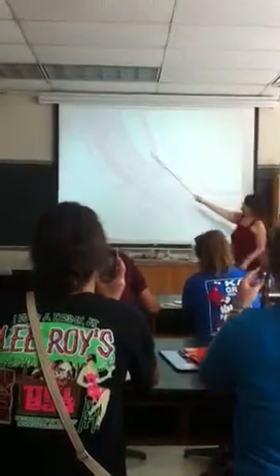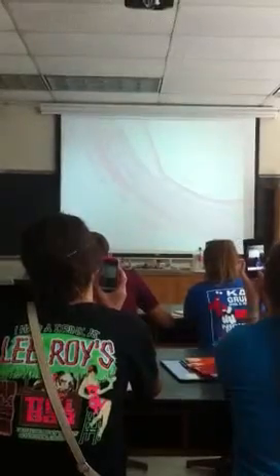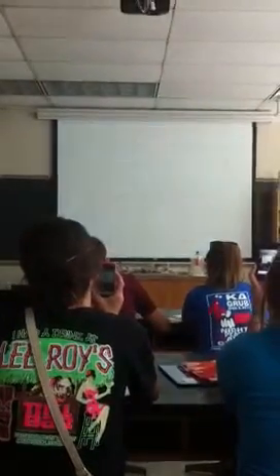Sadly, you can see this kind of space in between these two layers. That's just from shearing from when they were taking the section. So don't mind that. But I'll zoom in a little bit more so we can see a little more detail.